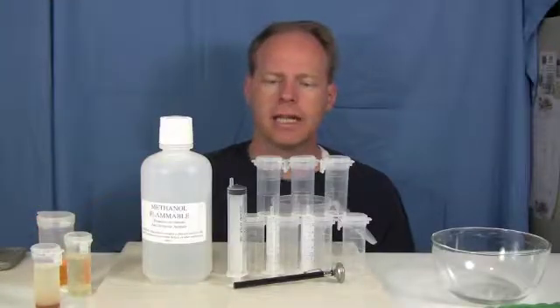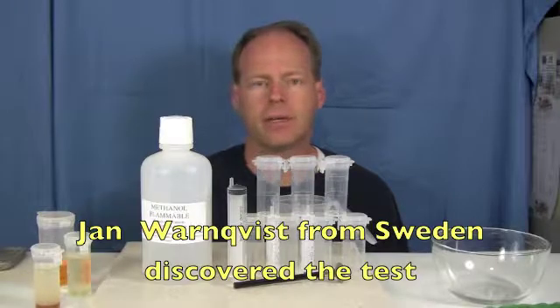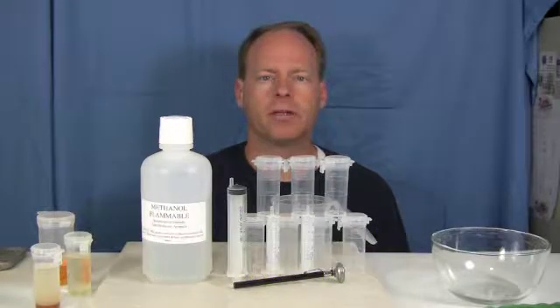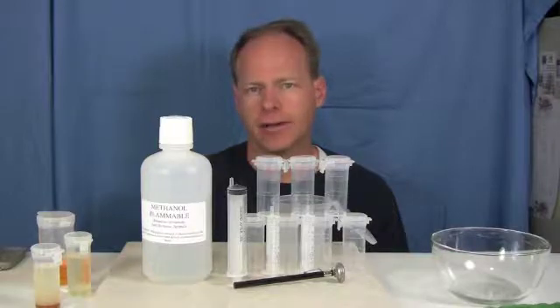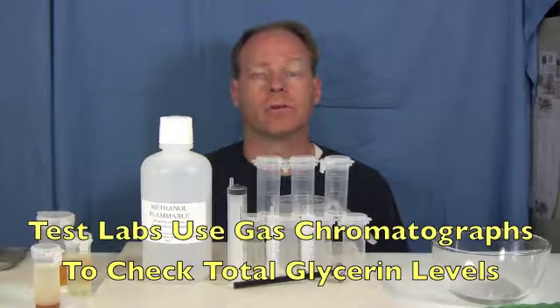The history of this test came from someone over in Europe that figured this out one day. A group of people in the United States decided to see how accurate this test was. In a biodiesel lab, if you were to send your fuel in to be tested for total and free glycerin, they would put it in a gas chromatograph.